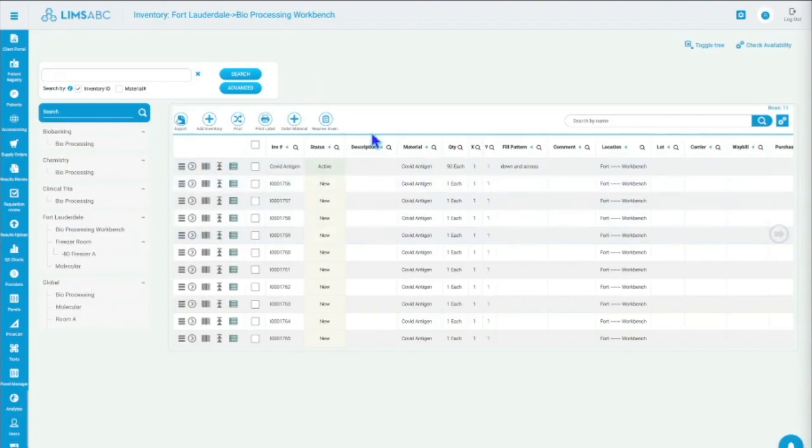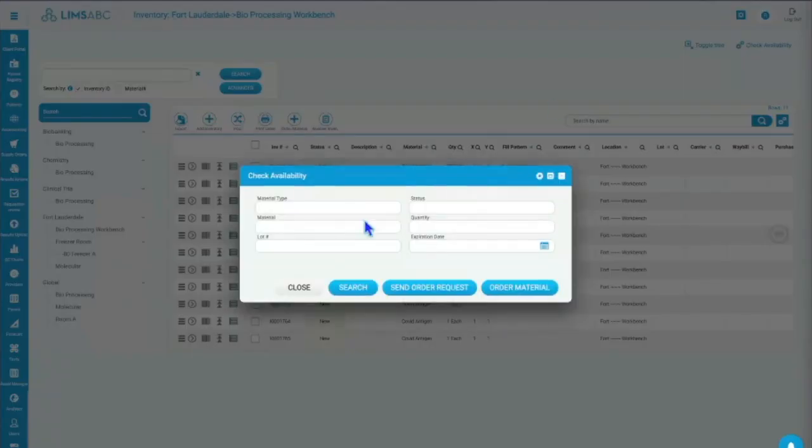That's high level. The other thing is we have a feature here that you can check inventory across your different locations. So if I'm, let's say, working in Detroit, and we have another location in, let's say, Miami, then you can check the inventory at that location, and you can request them to ship you inventory from that place. And then when you receive it, you'll search for that, and you'll request them to ship you.